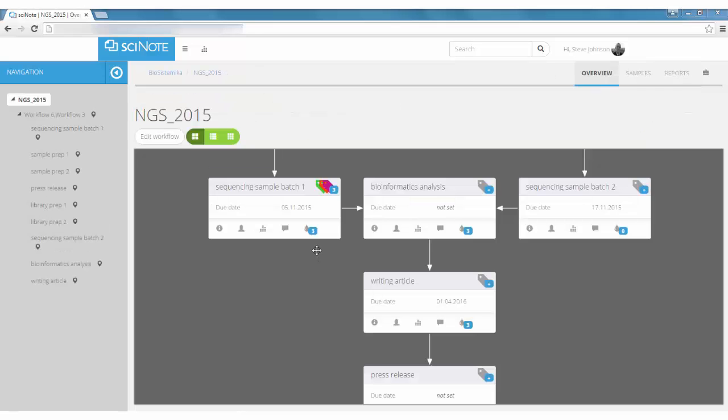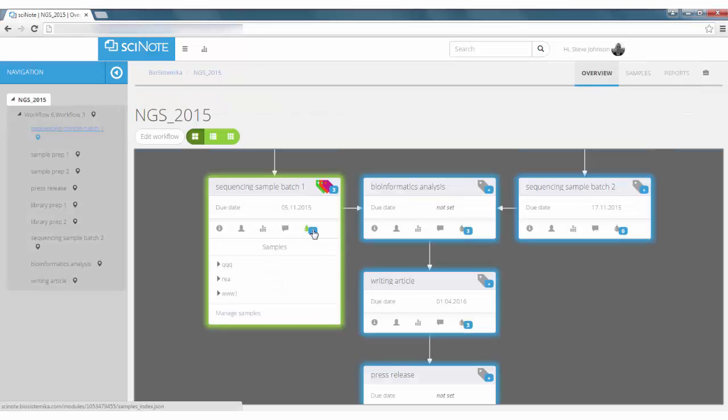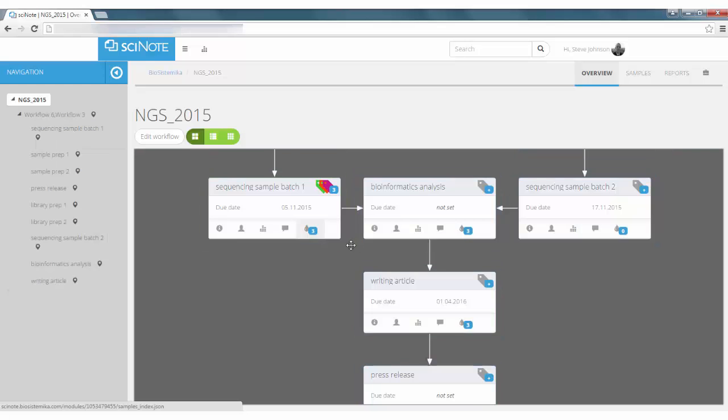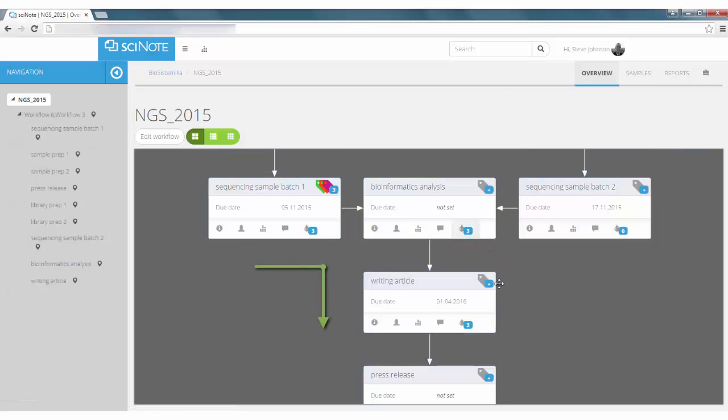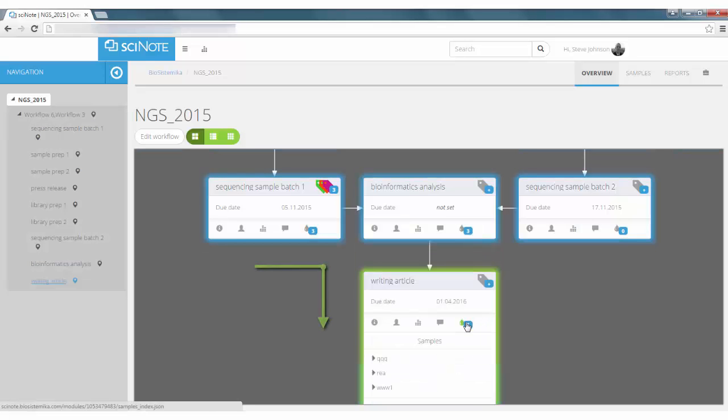If this module is part of a workflow, these samples will be automatically assigned to all modules downstream.